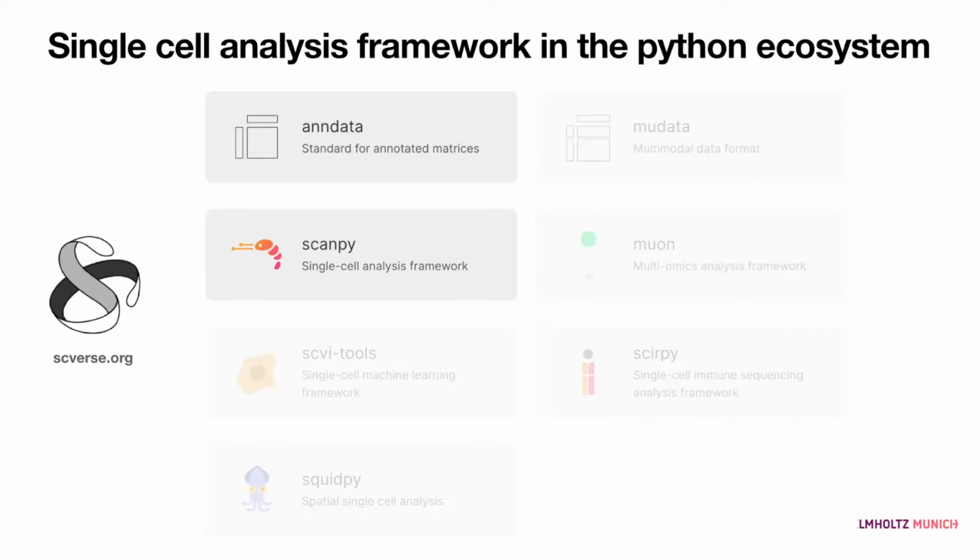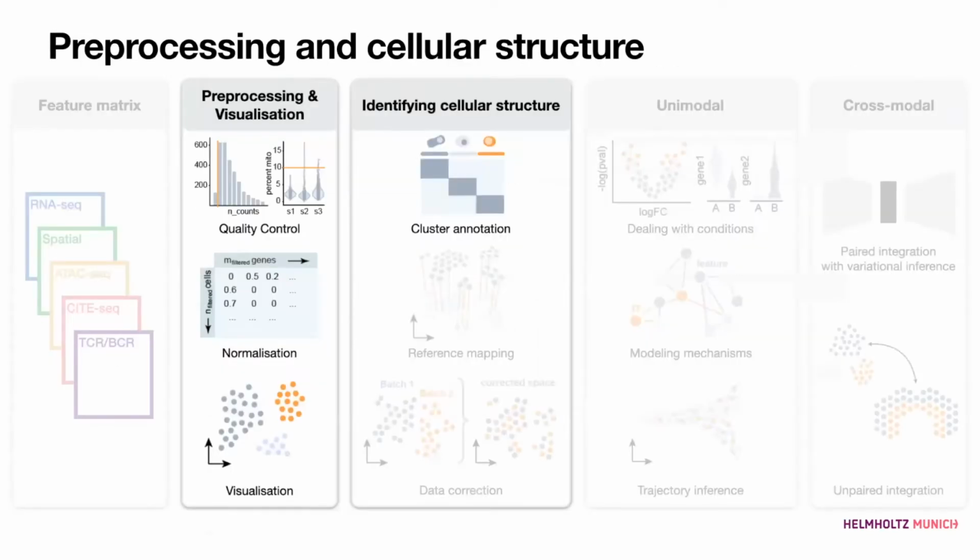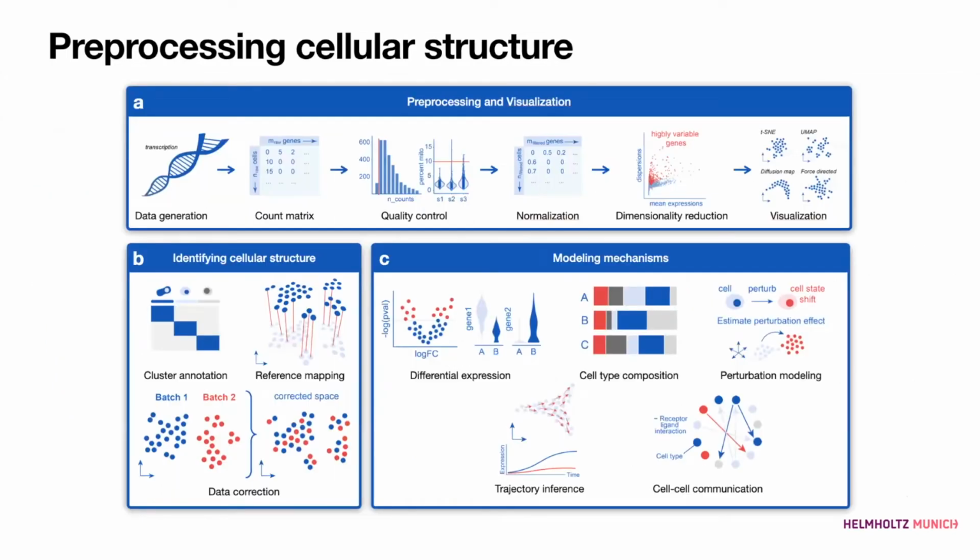Today, I'll just be focusing on AnnData and Scanpy, because these provide essentially the most basic preprocessing tools that we can have. Okay, so like I said, mainly I'll be looking at preprocessing, visualization and clustering, and maybe more in detail what this entails.